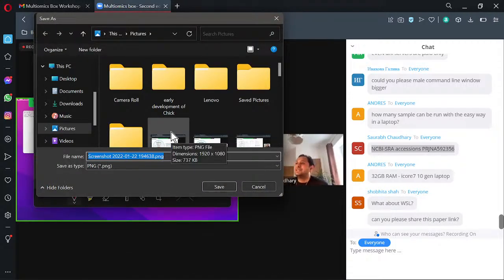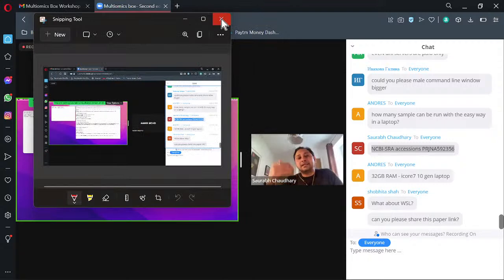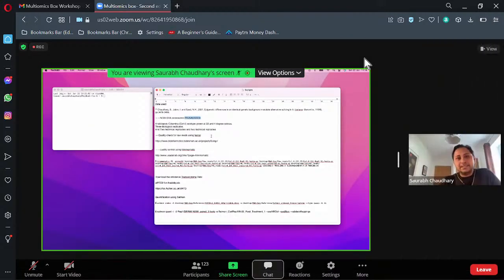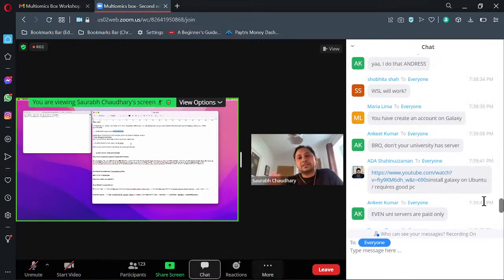This data is generated in our lab and it's available on SRA, and it has a number of files like RNA-seq, bisulfite sequencing, RNA sequencing. I'm using only the RNA-seq grown at 22 degrees Celsius and 4 degrees Celsius, only the Col0 ecotype.